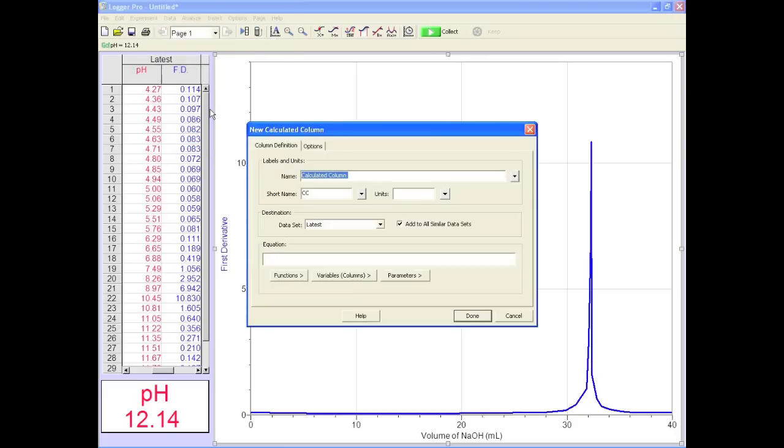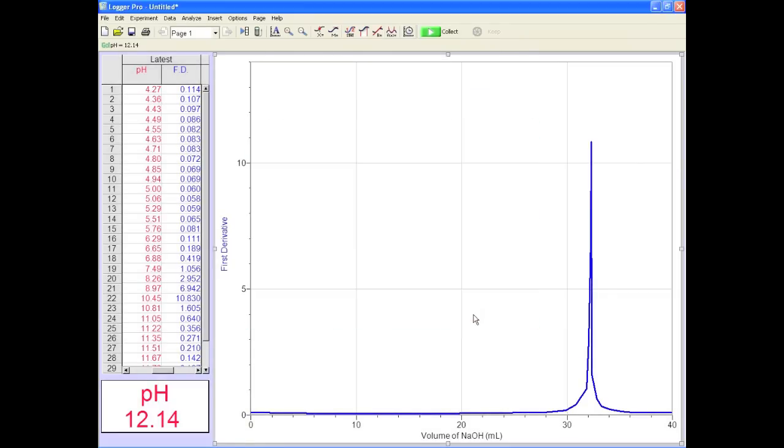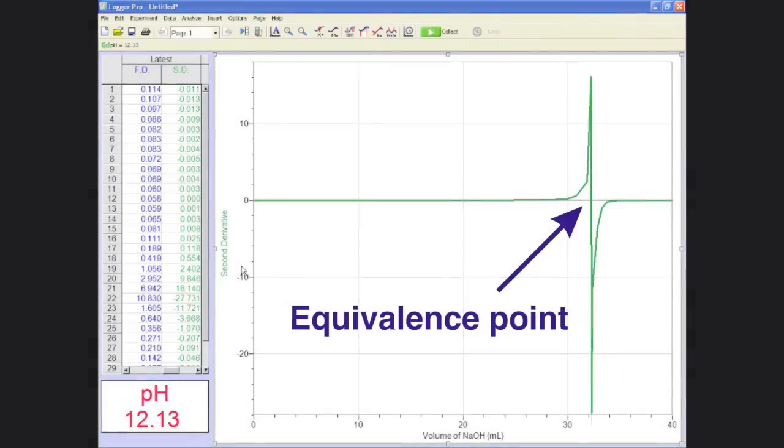Go through the same procedure as when calculating the first derivative, but this time, select second derivative. Call it up on the screen and check it out.